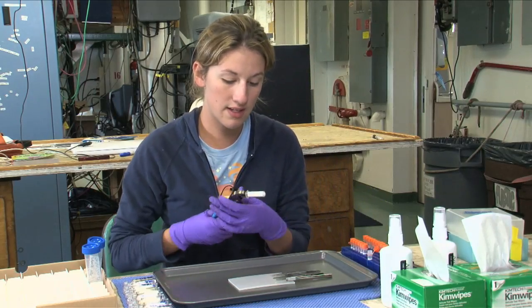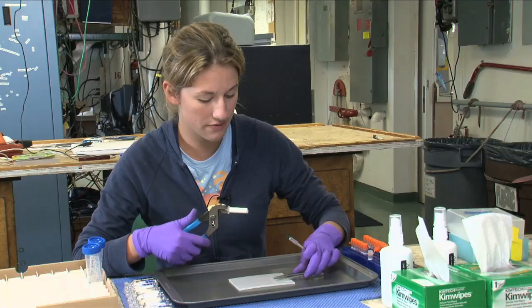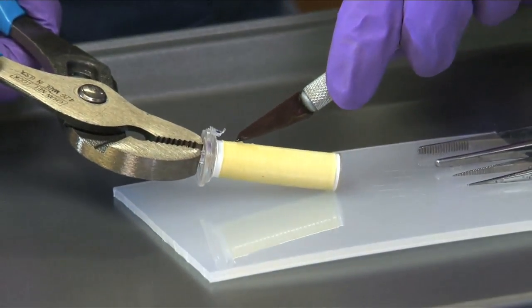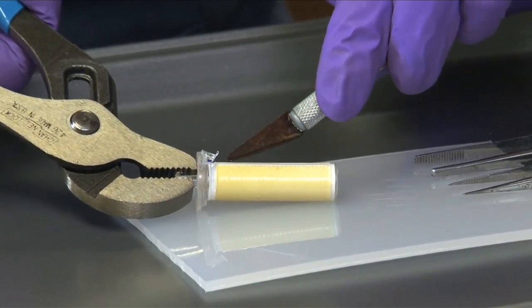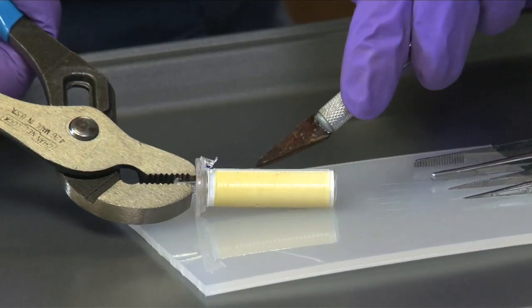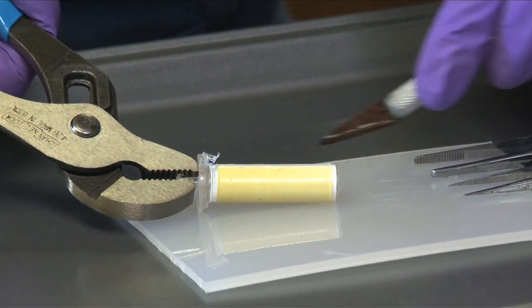So now what you want to do is cut off this filter. I use a sterile X-ACTO knife and sort of cut along the edge of the filter.